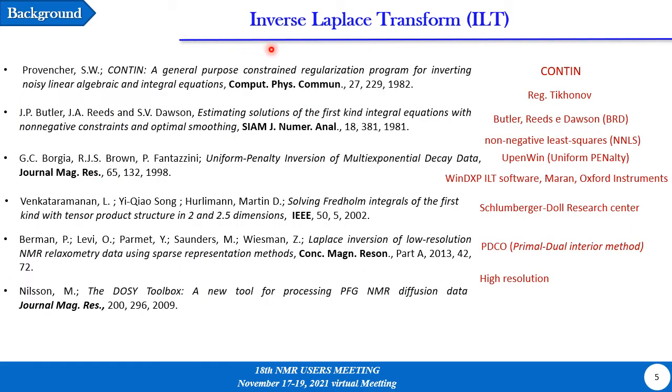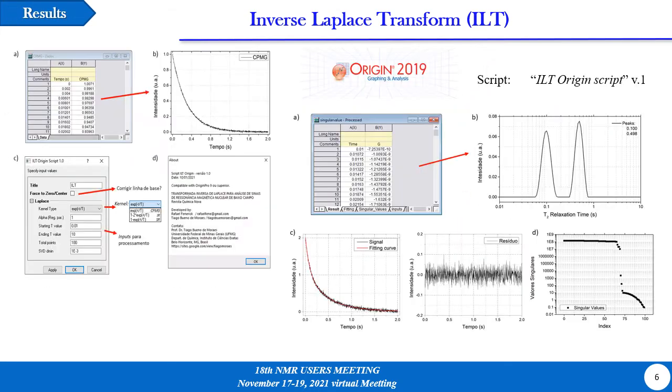There are several methods to perform this inverse Laplace transform. Some of the softwares come with the spectrometers, others are free to use, like these ones.